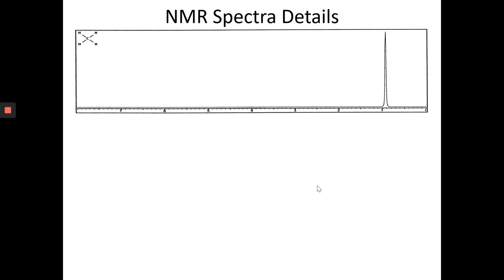Okay, so let's have a look at this. First of all, I want to give you a little bit of frame of reference and some context for this. NMR spectra are by convention read from right to left. So go to the right-hand side there. In English, we usually read from left to right. Here we're going to read from right to left. This is for historical reasons, which has to do with how these instruments were first put together and how the pages would unspool and how the pens would write on them. But we never changed. So we're still reading from right to left.